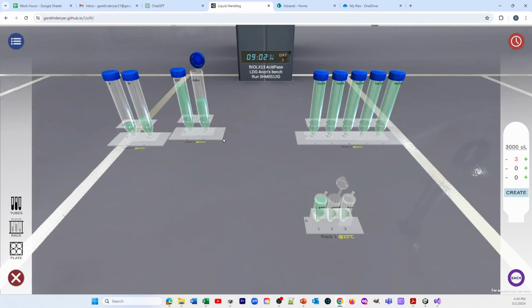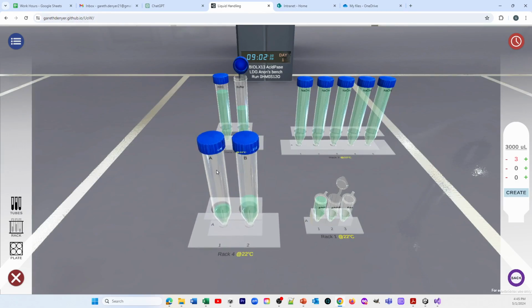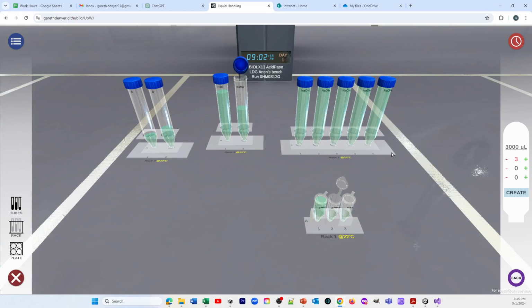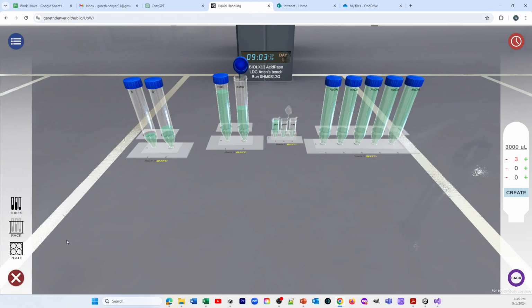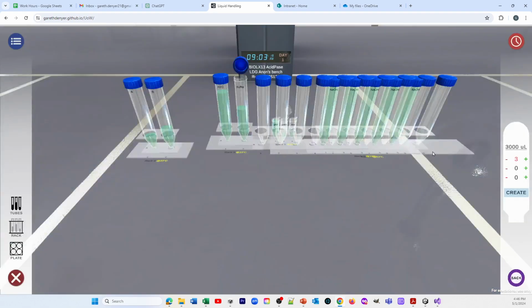Now the reactions we're going to do are going to be, I'll just bring this back over, because we're going to mix a mil of this in with the substrate in B. And as soon as this enzyme here hits this tube, it's going to start the reaction. Now, we're going to take samples from tube B at various stages and we're going to put them into sodium hydroxide. So we're actually going to set up a rack with, I think it's 10 tubes. It might be 11, but it doesn't really matter. We only need enough tubes to give us enough time points. And we're going to set up this very, very large rack.